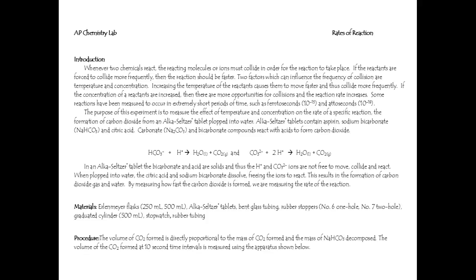Plop, plop, fizz, fizz. Alka-Seltzer tablets contain aspirin, that's nice, and sodium bicarbonate, plain old baking soda, and some citric acid. Carbonate and bicarbonate compounds react with acids to form carbon dioxide.